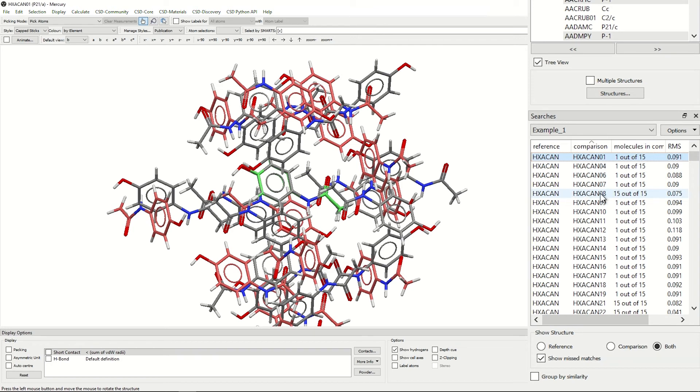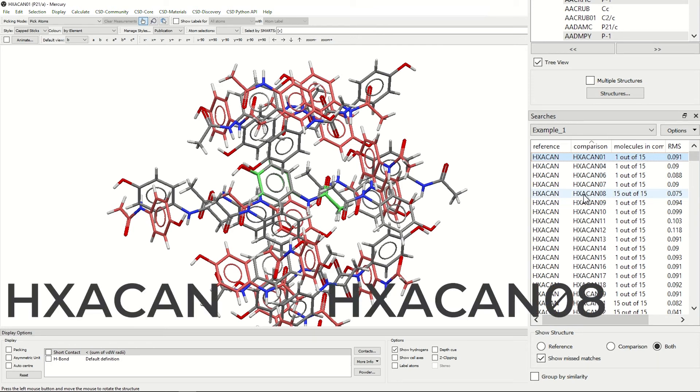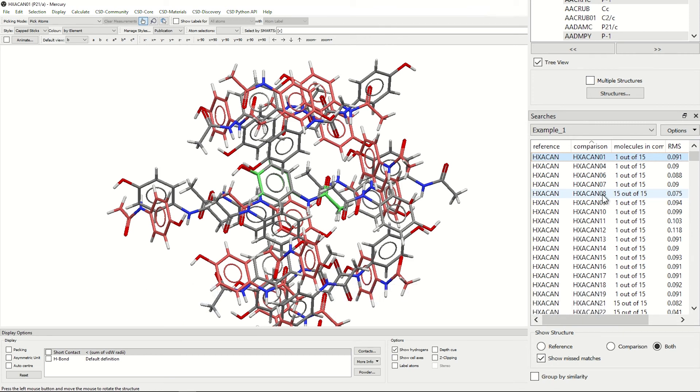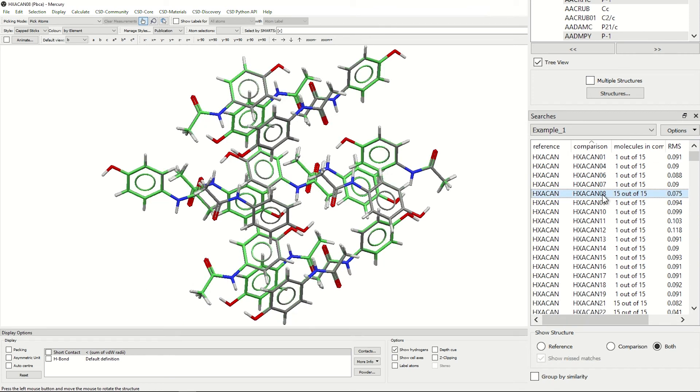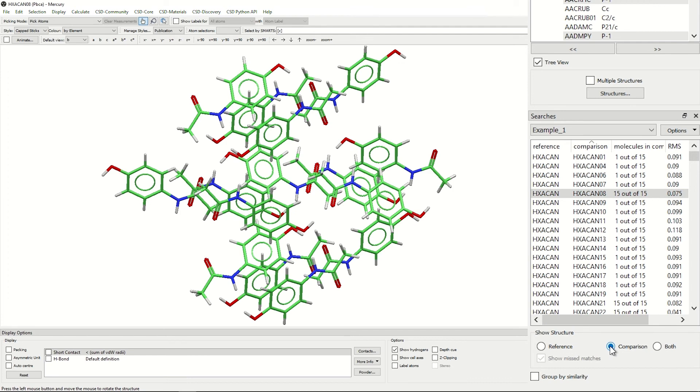If we then change to this comparison between HXACAN and HXACAN08, this has 15 out of 15 molecules in common. If we click on that, we can see that all of the molecules are successfully overlaid, and if we click on comparison, we can see that they are all green.